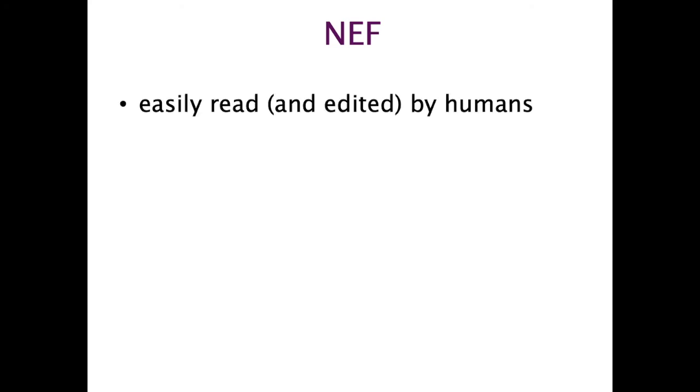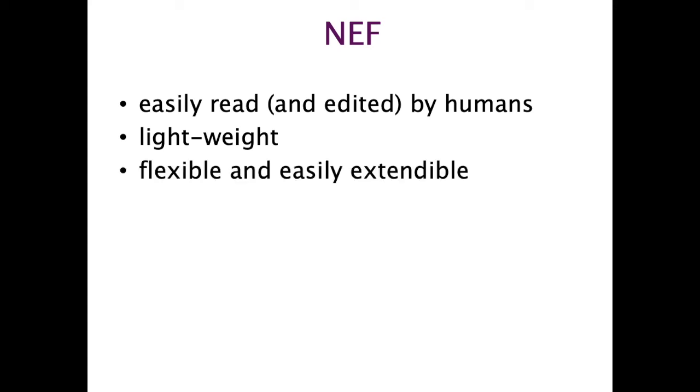So where does that leave us in total? Well, it means that NEF has a format which is easily read and also edited by humans. That's always quite convenient and certainly better than XML files, for instance. It is fairly lightweight, so the sections that have been made mandatory are fairly limited. It is also flexible and easily extendable.